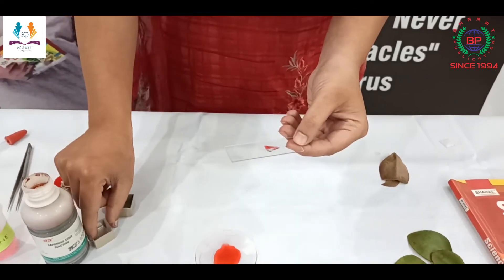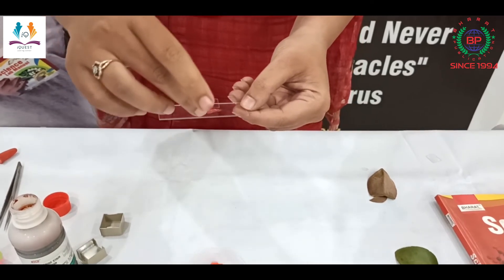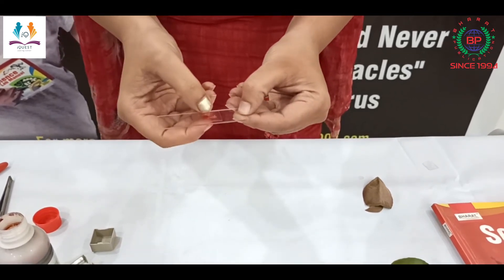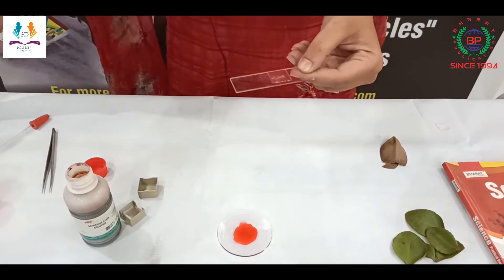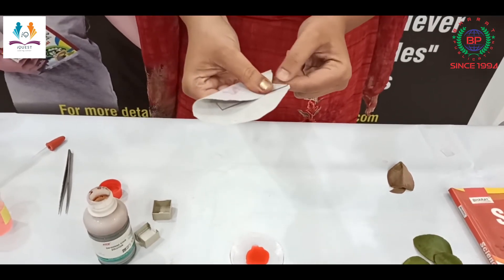The next step is putting the cover slip over it in a way that there should be no air bubble. Now I will press it and clean it with blotting paper to remove the extra stain as well as the glycerin.